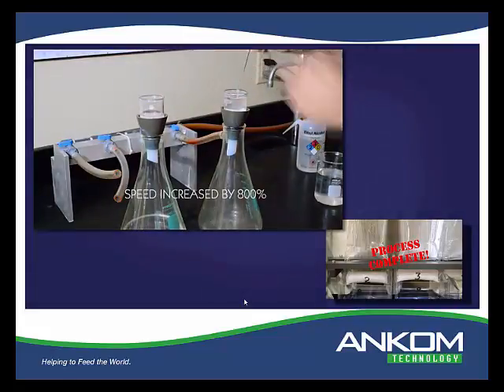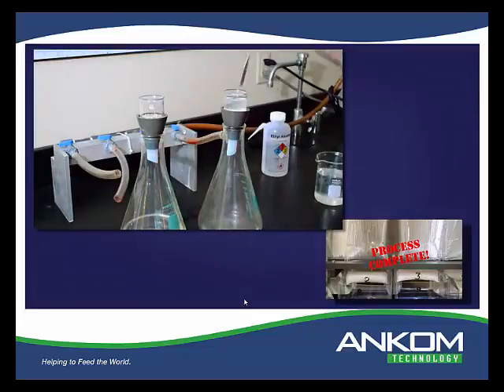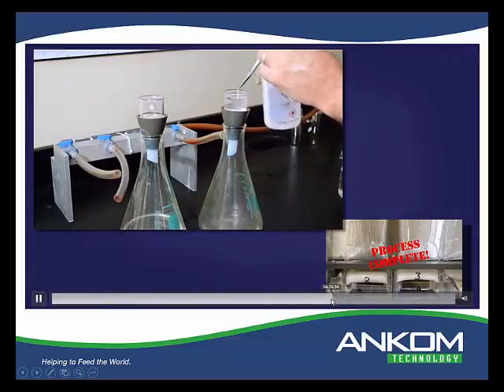So the system's still going. We're doing the rinses on the oat bran. We're still trying to filter the pectin. So I'm just going to speed this up because I don't want us to spend a lot of time just looking at it. I think you get the point.